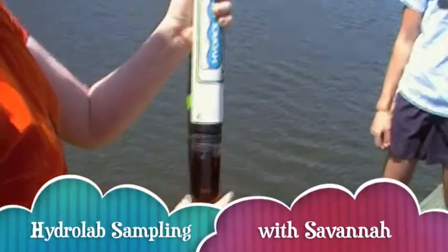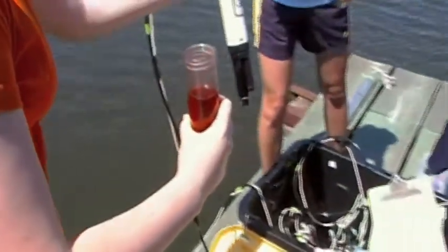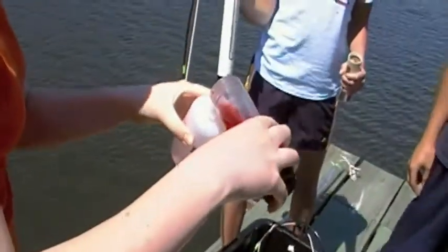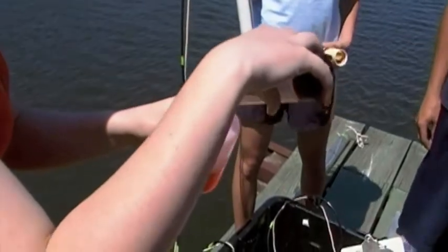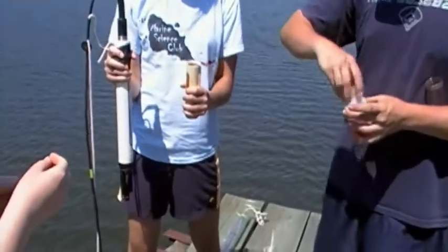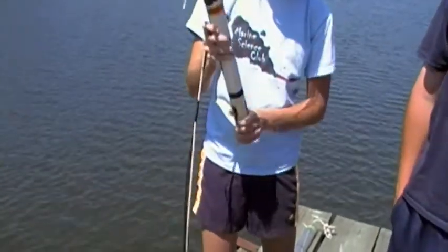Hydrolab sampling. Remove the cap containing the pH 4 solution, then place the solution in the provided bottle. Then place the sensor cap on the Hydrolab, making sure that it is secured tightly.